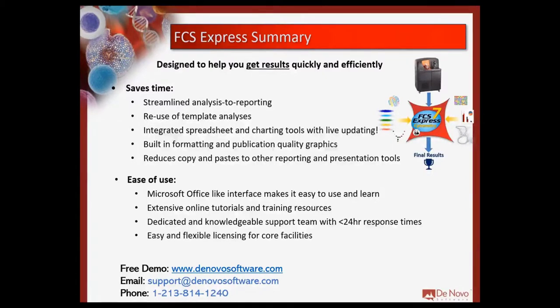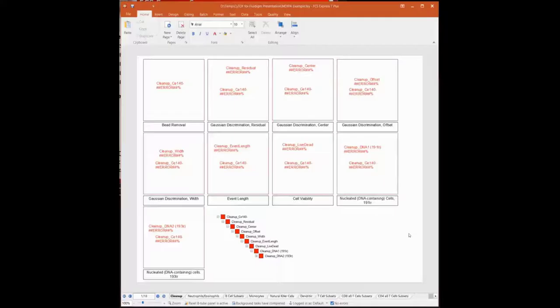Okay, so I'm going to use the last few minutes of the presentation to give an overview of an actual very commonly used assay that is commonly used with the Helios data from the instrument, and that's an example of the MaxPar layout or the MaxPar kit. You can see here, I've switched over quickly, and this is a view of FCS Express.